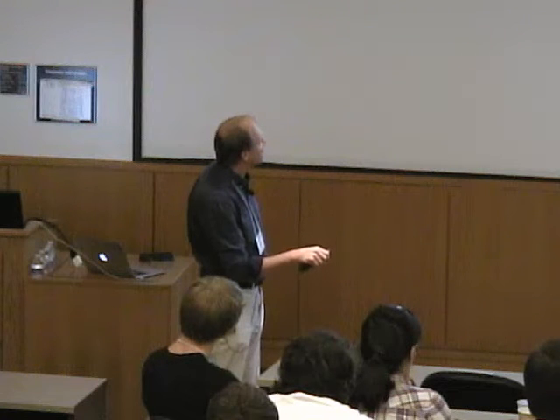One thing to notice, though, is that if I'm measuring down here, when the oscillating field is high, then the signal that I see out here will also be high. On the other hand, if I'm on this side of my line, when my green curve, the oscillating magnetic field, is high, the signal is low. So if you look at these two waves, they're out of phase with each other. When this one is low, that one is high. So they have different phases.